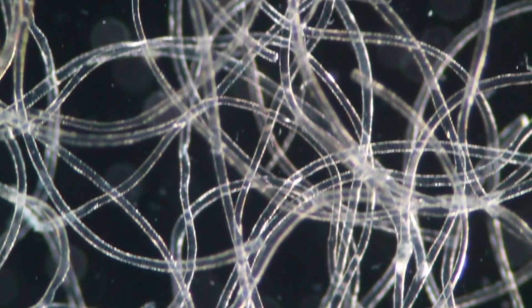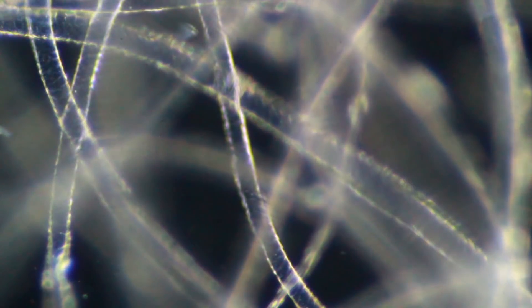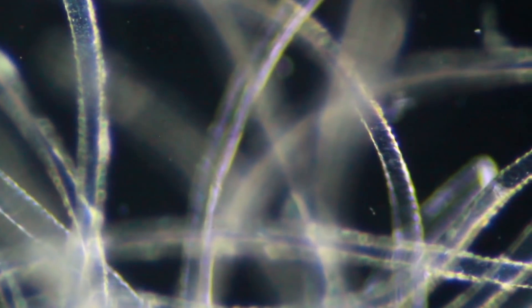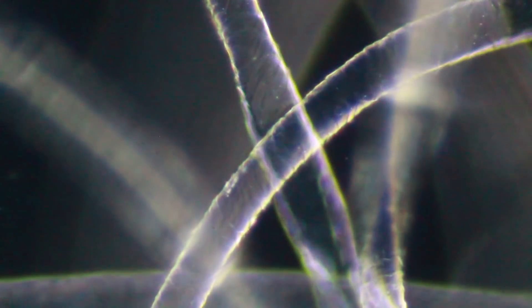Here we see the same fibers again, bright on a dark background. We can see now that they're quite transparent — especially look at those places where the fibers overlap. You can actually see through them; they're a little bit glass-like, which you do not see on the animal itself. At higher magnification it becomes evident that they allow quite a bit of light through. I had to open the condenser a little bit because the dark field patch stop requires a lot of light, which does reduce depth of field. You can still see a little bit of the surface texture on the individual fibers. I think it's quite interesting to observe all of the intricate details of everyday objects.